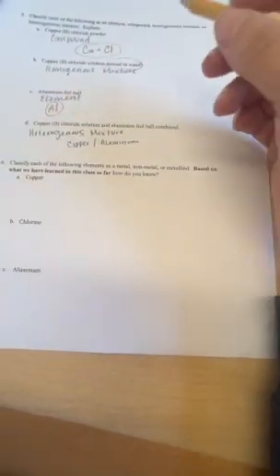Those are the two metals that we've added here, and then we see deposits within that solution later. So because we can distinguish one part of that mixture from the other, we're going with heterogeneous. We can see little globules or whatever floating in that water, so we can distinguish between the different parts of it.